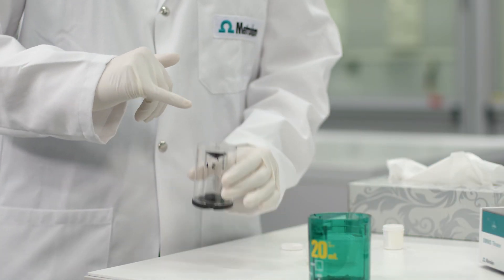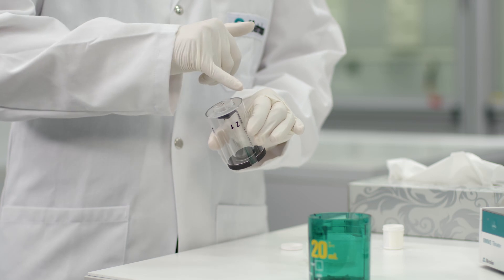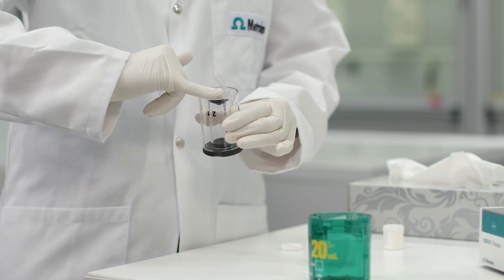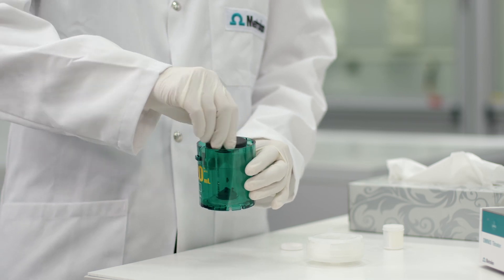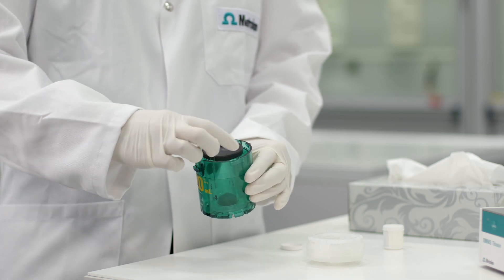In the next step, lubricate the centering tube and the inside of the housing. Apply some grease as uniformly as possible on the top of the centering tube. Press the centering tube lightly into the housing and distribute the grease by turning it a few times.